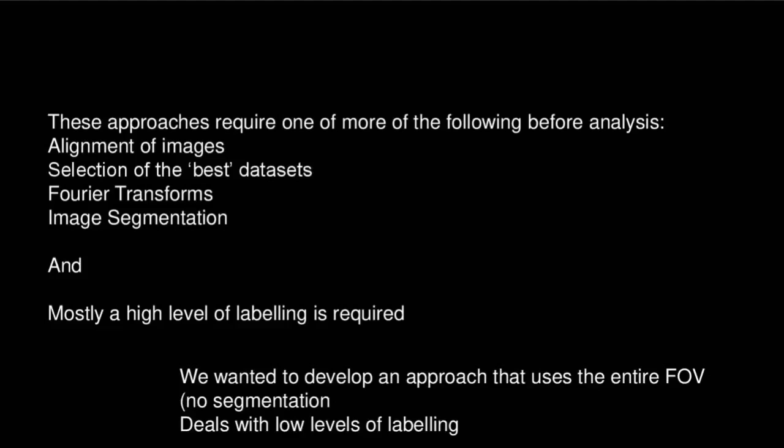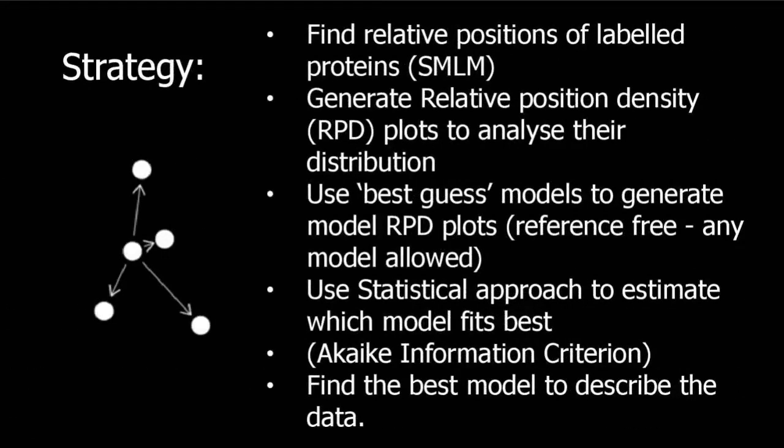So we wanted to develop a technique where you could use your entire field of view. You didn't have to segment, and you could deal with the low labeling levels that you quite often get in super res. So this is the overall strategy. It's pretty straightforward and simple.